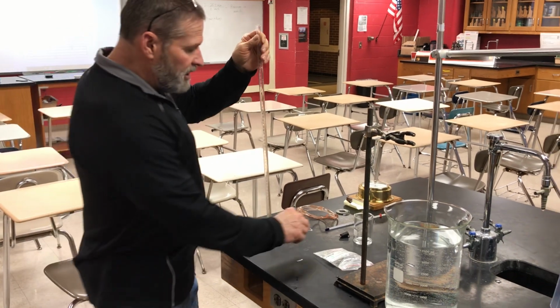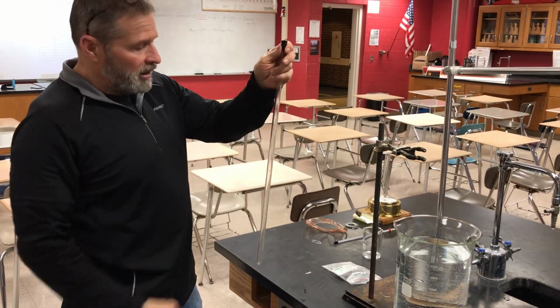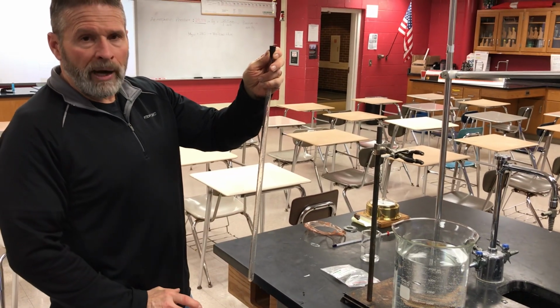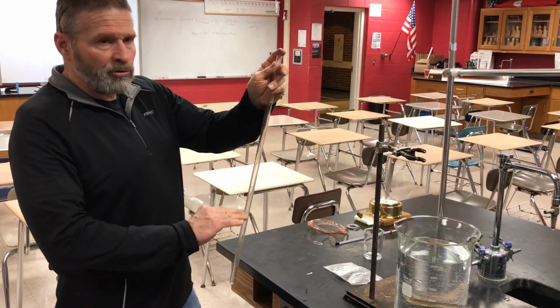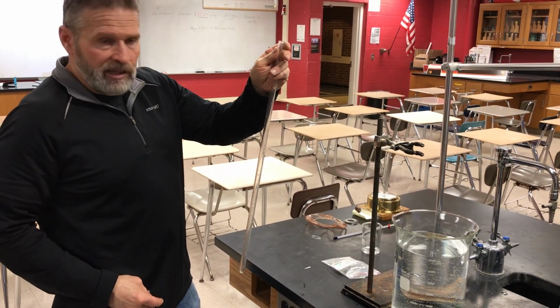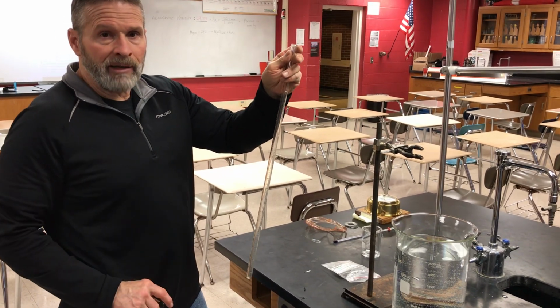The magnesium will be up at the top. We'll show you that in a minute. That way we keep our reactants separate until we're ready to go. And then we're going to invert the tube, and the HCl will sink down through the water column, and it'll gradually run into the magnesium and cause our reaction to start. You'll see this in a minute.